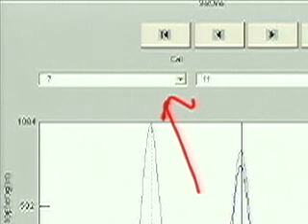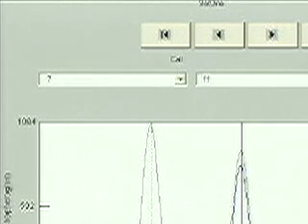Another thing to point out with True Allele System 2 is the priority. There is a priority that is associated with all the samples. So in running this sample through the batch of samples, if I had a whole bunch of samples that were processed through True Allele System 2, this is my top priority for this locus to evaluate. The reason this has received top priority, or priority number 1, is because you can see the quality value to the right of that is 0. Since my quality value is low, I am looking at this sample, and it has passed through all the other samples that have met all the laboratory-defined criteria.